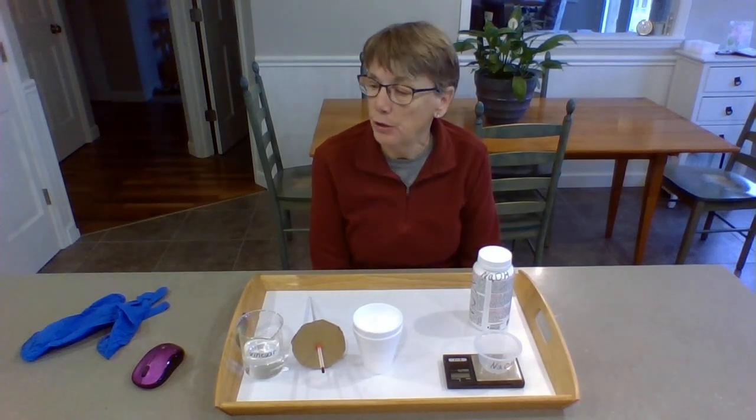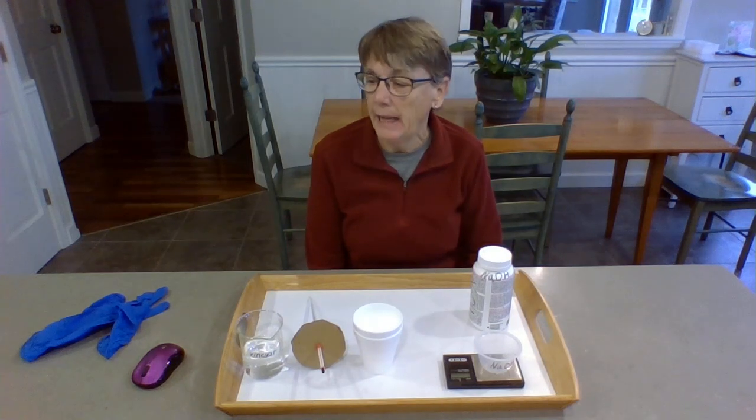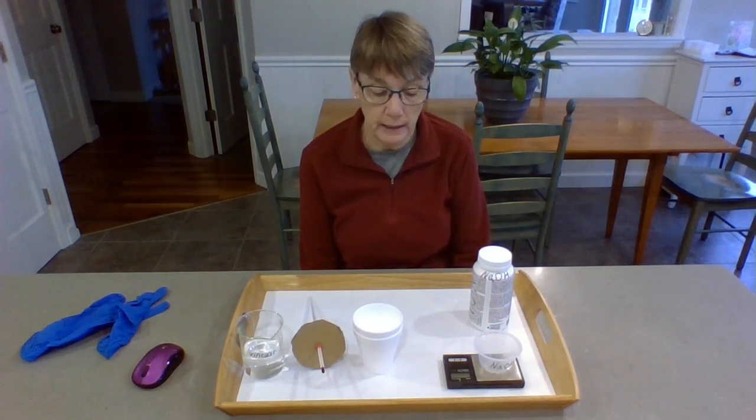So this first lab we're going to do, it's in their lab packet. It's Chapter 14, Lab 1, measuring delta H. Delta H stands for change in enthalpy. And like I say, we'll be talking more about what that means. But we're going to do a reaction here. I'm going to do it for you.